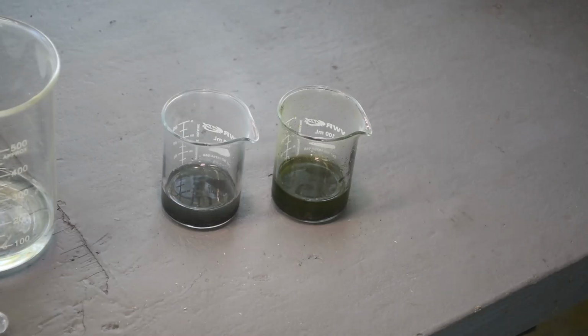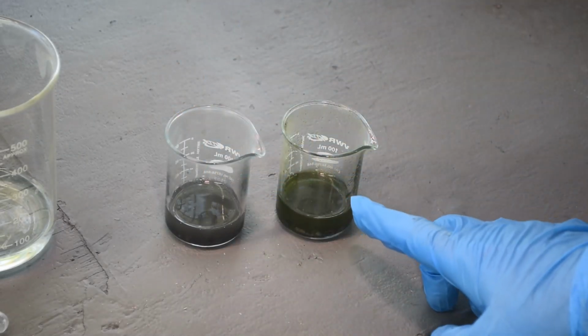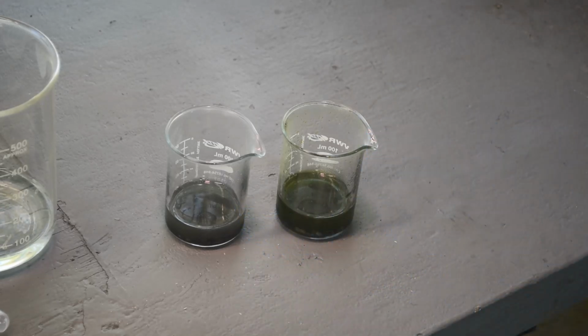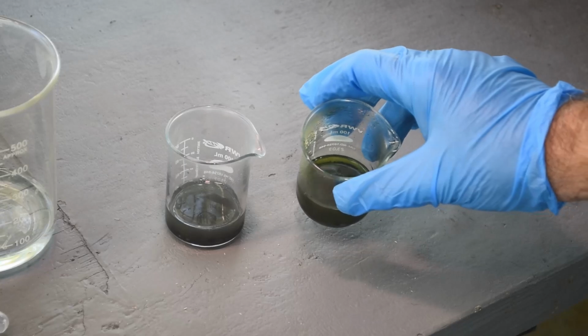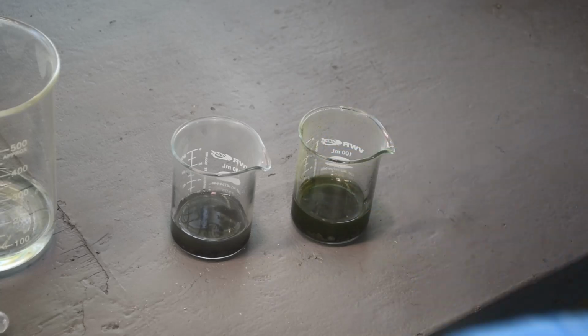Alright, so it's been almost 24 hours. And I've got my two samples here. This one was hydrochloric acid. This one's sulfuric acid. All right, so some observations. This one seems to be done. I don't see any more activity in here. This one's still bubbling. So obviously it has not consumed all of the iron in there yet, even after 24 hours. So this one's still going.